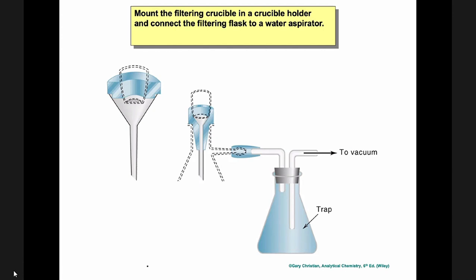So anyway, we will be performing total suspended solids in water as one of your laboratory activities, and we will be using a vacuum filtration setup. So you will see it. I am just introducing the common apparatus and their setup, an introduction to your laboratory activities later. The first one this afternoon, we will be performing calibration of pipettes, volumetric glasswares, and burettes.